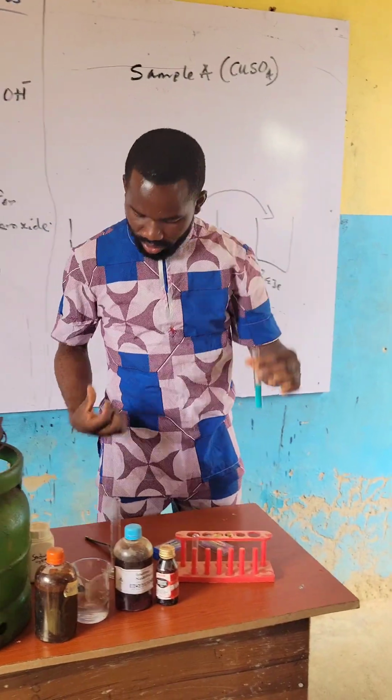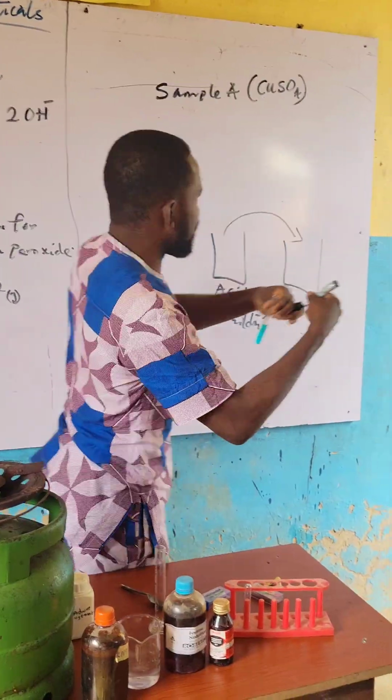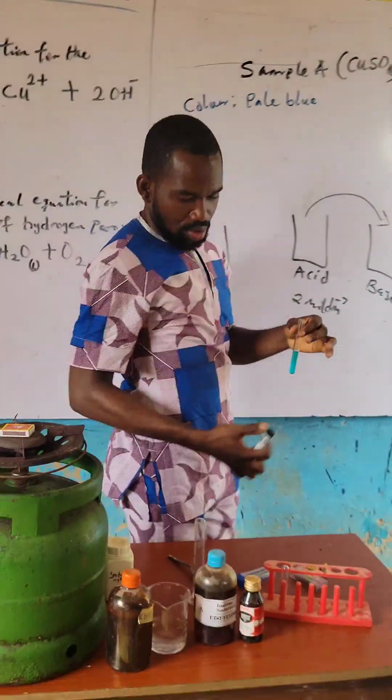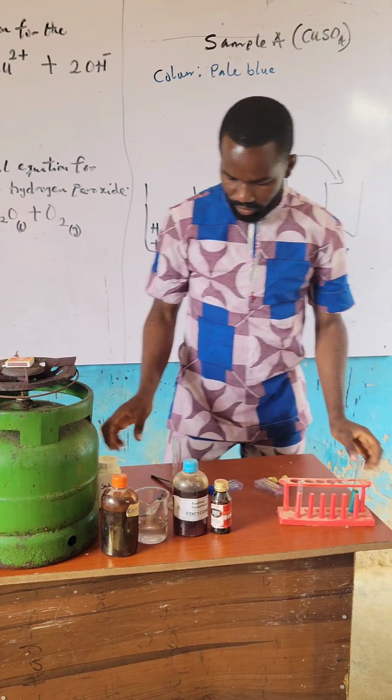Yes, sir. So this is the color after you dissolve it. This color, blue. Pale blue, it's not that blue. Then they will now ask you to drop sodium hydroxide.